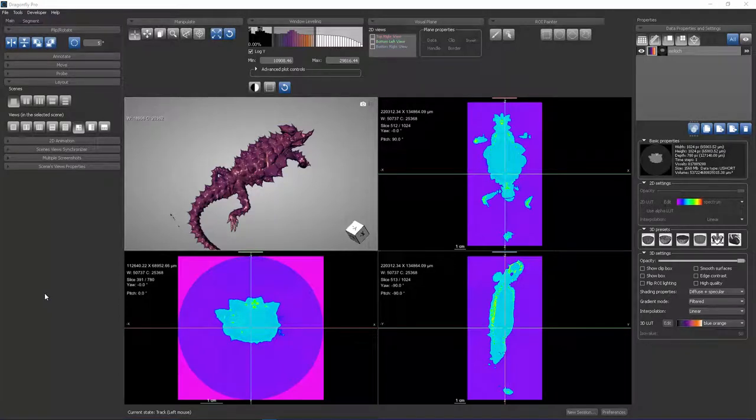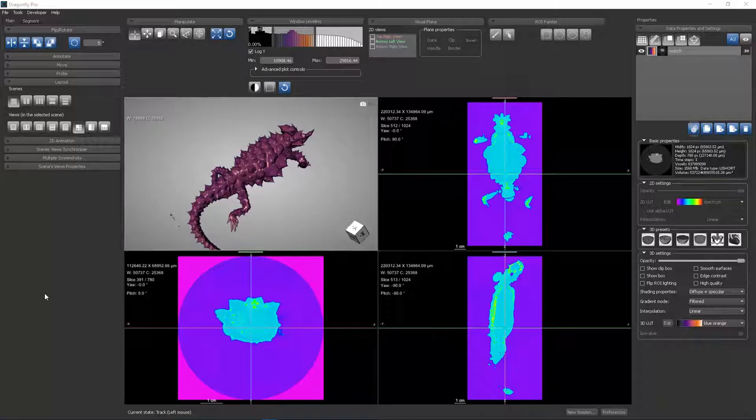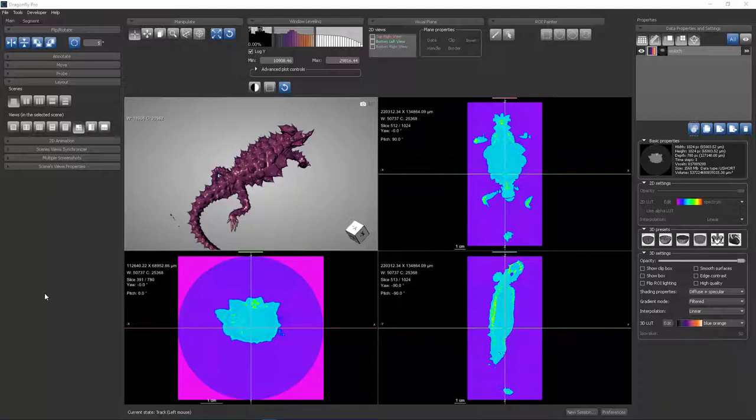In this Dragonfly 3 training video, we're going to examine the behavior of LUTs, or lookup tables. Lookup tables are the tools you use to map image intensity to on-screen color.